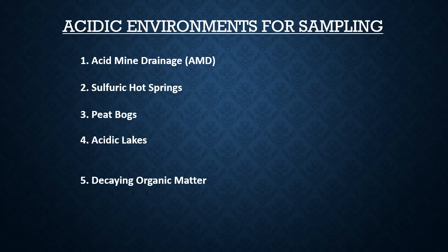The accumulated organic material is peat, which is acidic due to the low decomposition of plant material, and pH in these environments can be below 3 or 4. You need to check that. The sampling tip is to collect water samples from bog pools, or you can gather peat soil samples from the surface and subsurface layers.